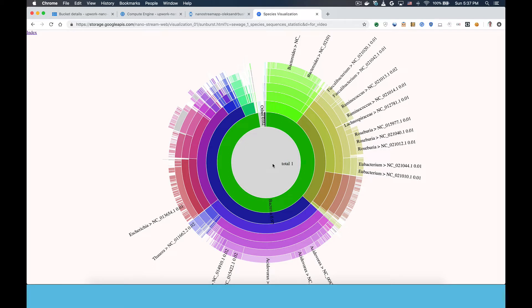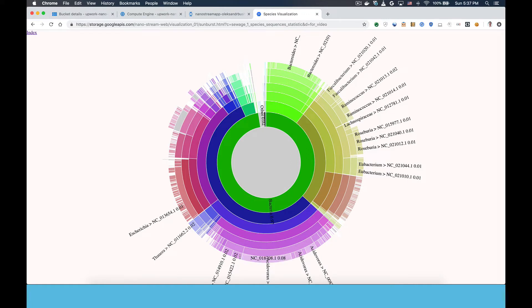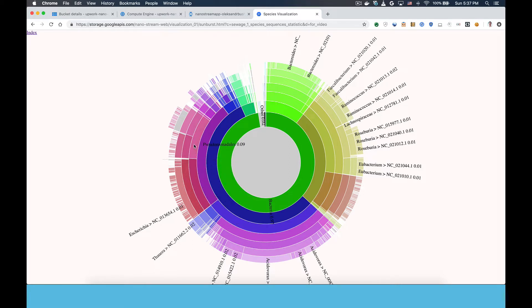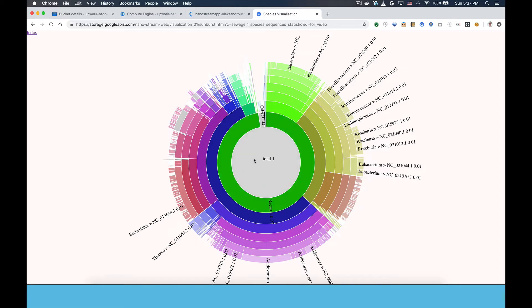The outer rings represent the genomes of individual species or strains of species that were detected in the processed sample, and the size of each arc within a ring is proportional to the amount of each class of thing that was detected in the sample as measured by the amount of DNA reads that were observed from the nanopore sequencer.